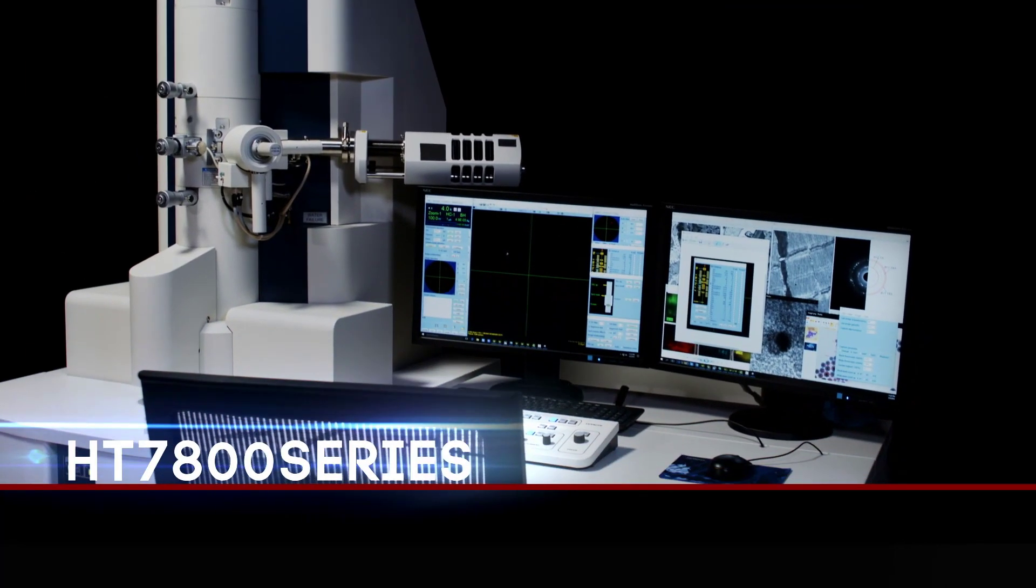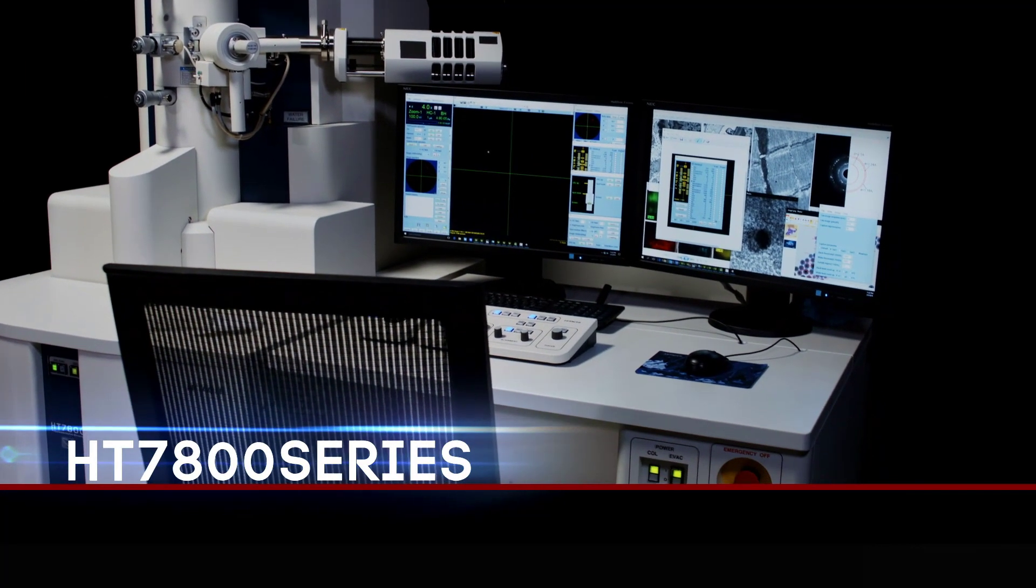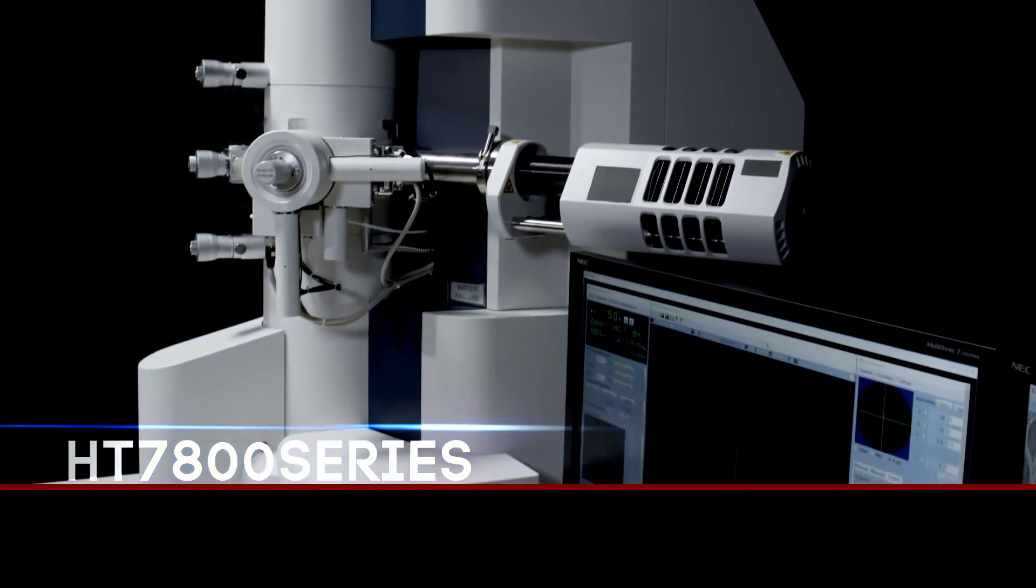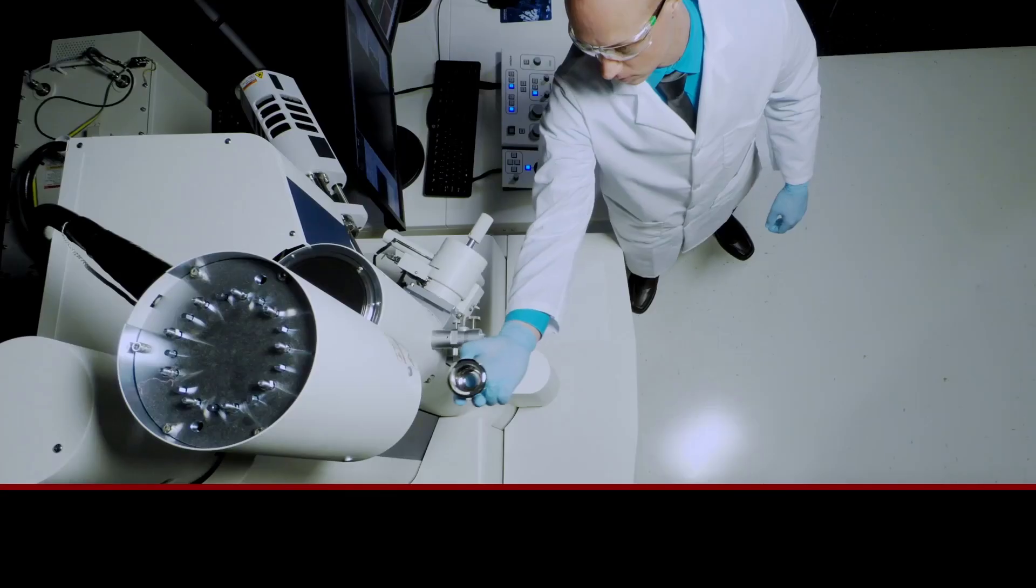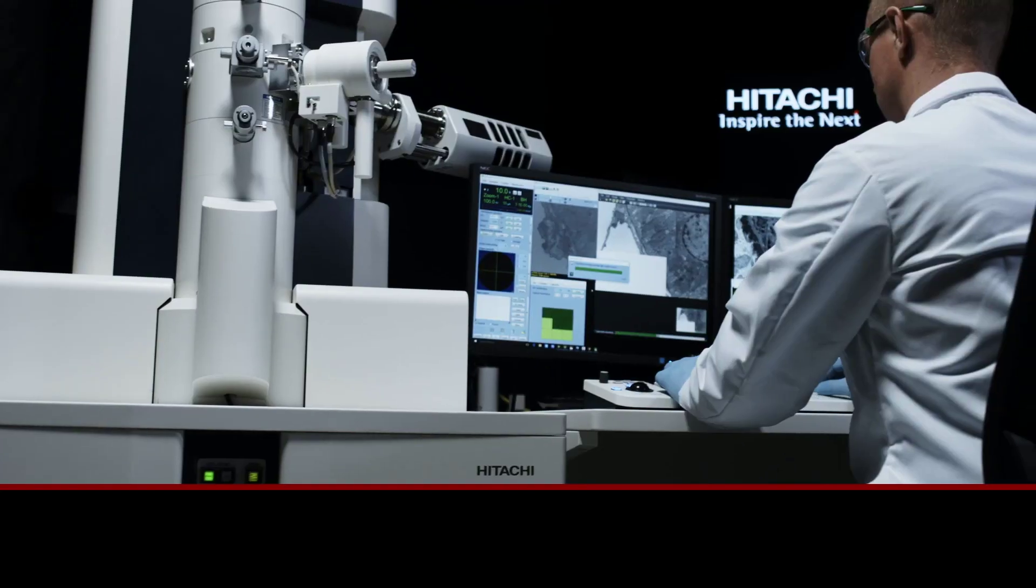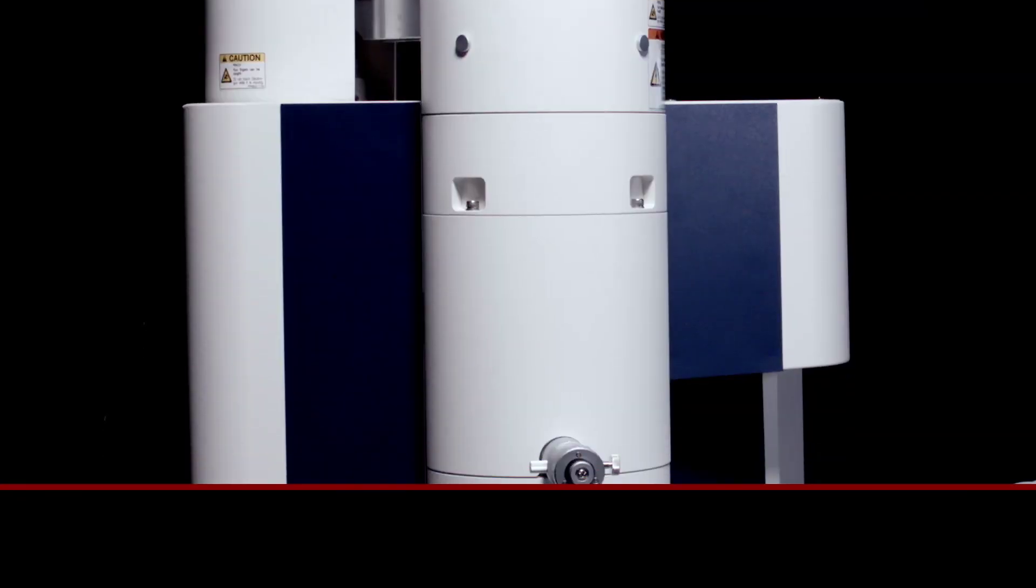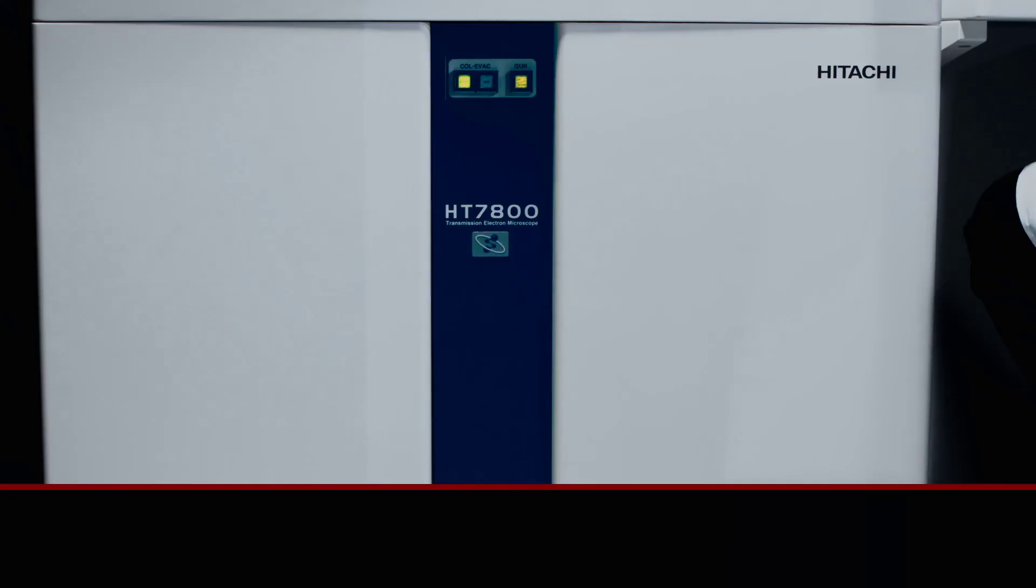The state-of-the-art HT7800 TEM series features novel electron optics and revolutionary integrated technology to provide a robust, easy-to-use transmission electron microscope that is not only powerful, but also designed to be extremely versatile.